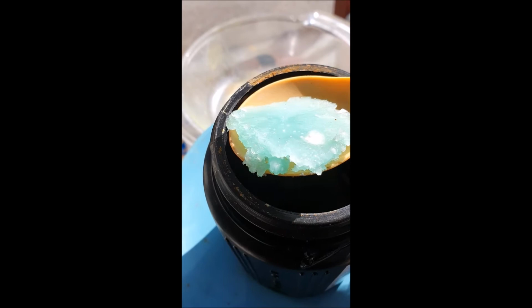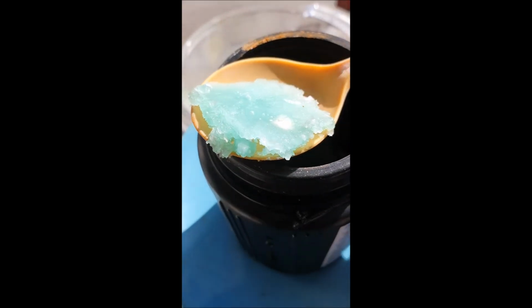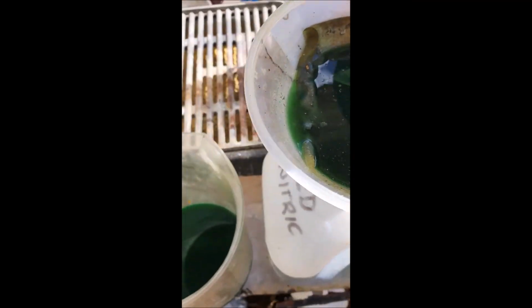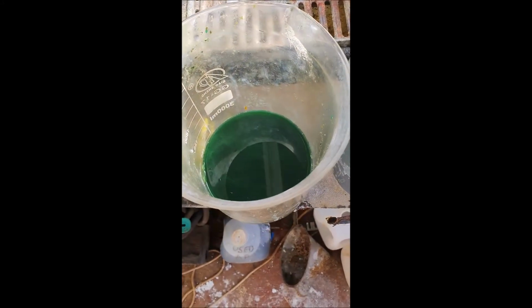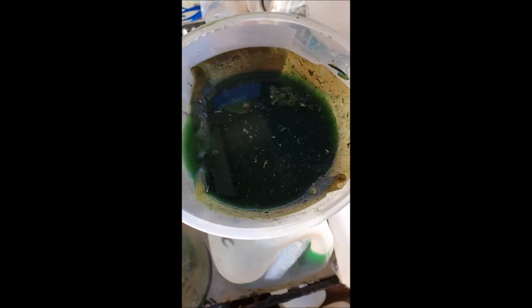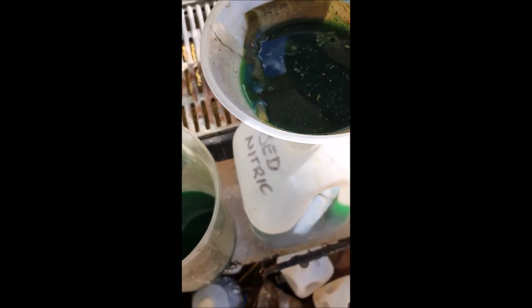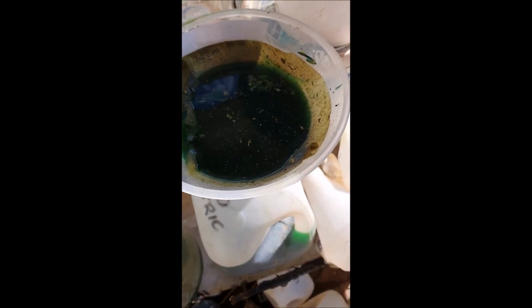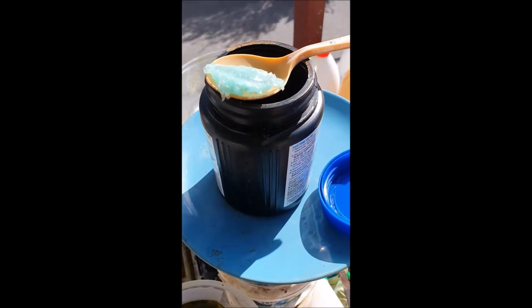So what I'm going to do is, I've got some gold foils filtering here, a little bit more nitric acid with gold foils in it to go in the filter. Once I finish doing that, I'm going to make a bit of AR and dissolve the gold. There's not going to be much in there. Hopefully it's just enough for a test to show you guys how this crystal works.